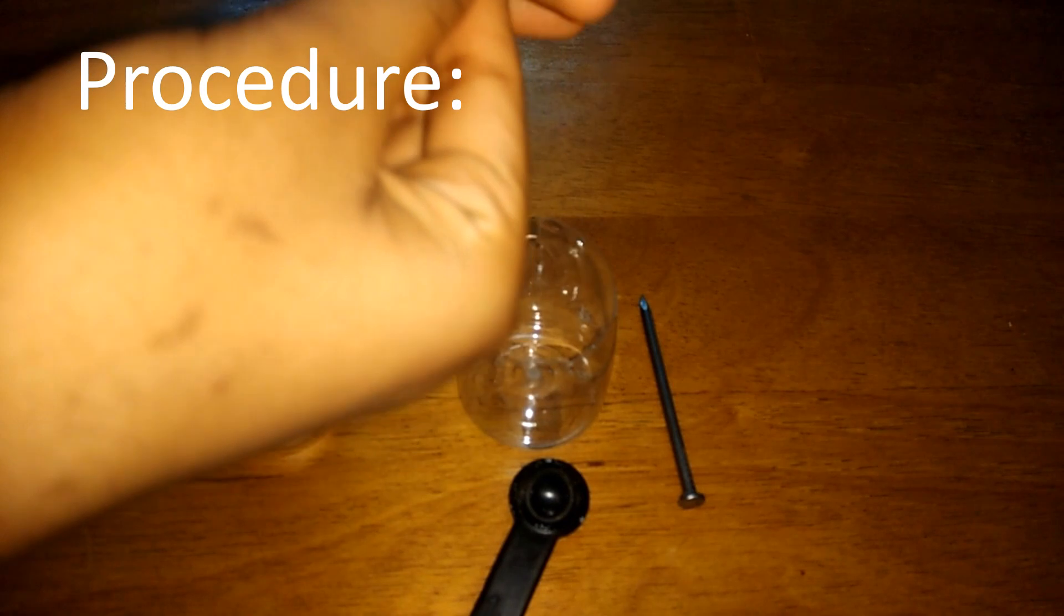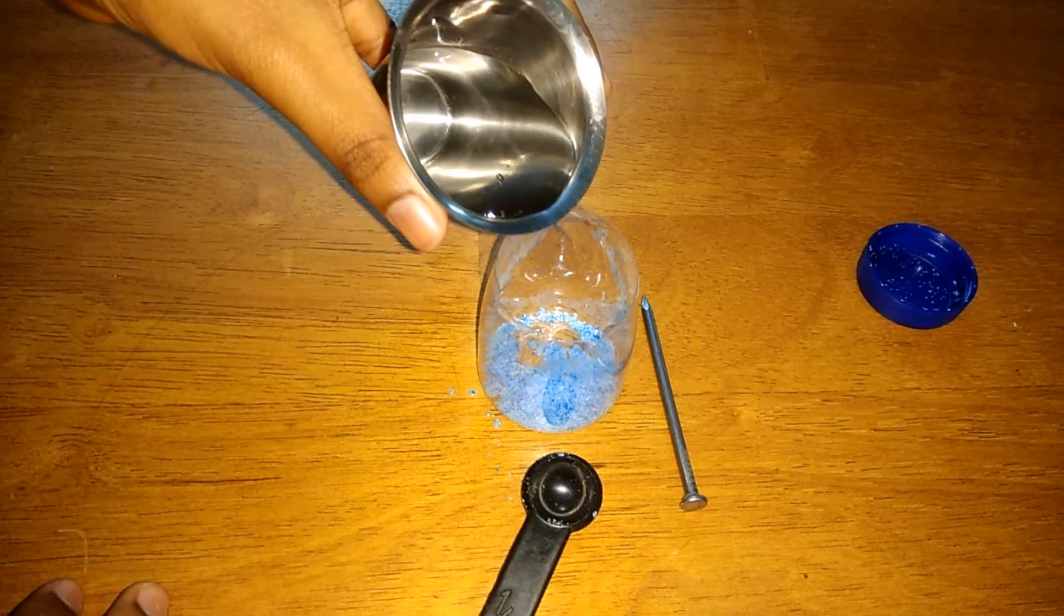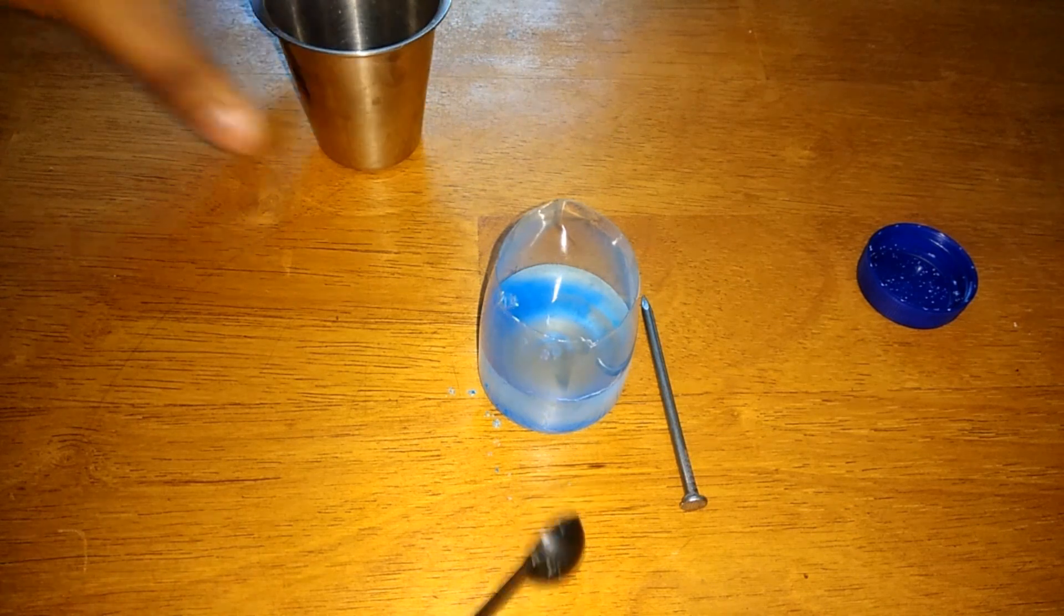First I am going to take the copper sulphate and I am going to put it into the container. Now, I am going to add some water. I am going to stir it well.